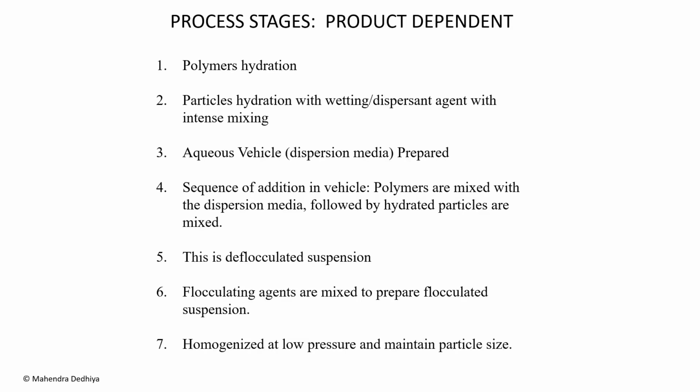The processing stage in lab scale is: polymer needs to be hydrated, particles of solids need to be hydrated with wetting agents, and intense mixing is required. The aqueous vehicle is prepared with a sequence of addition, generally as polymers are mixed in dispersion media followed by hydration of the particles or the solids.